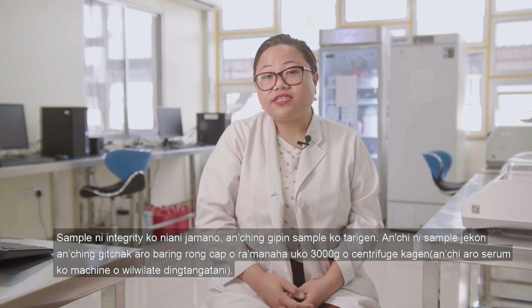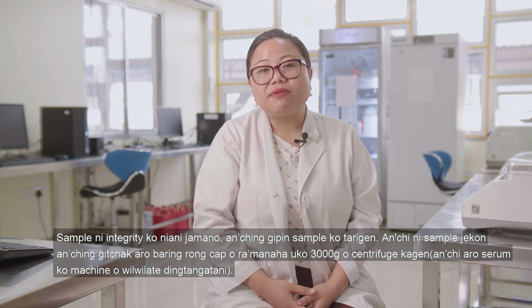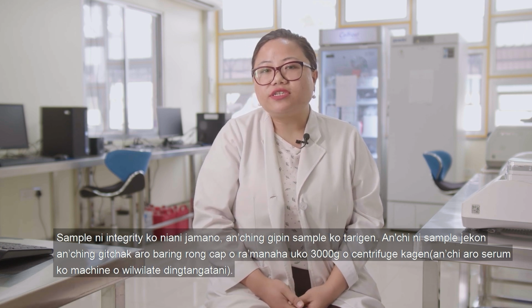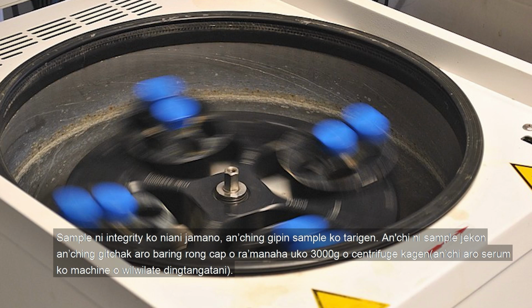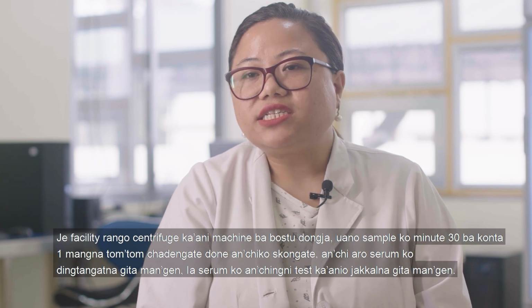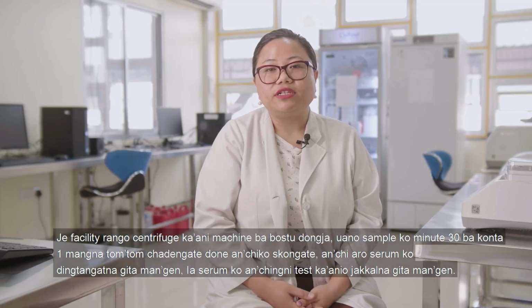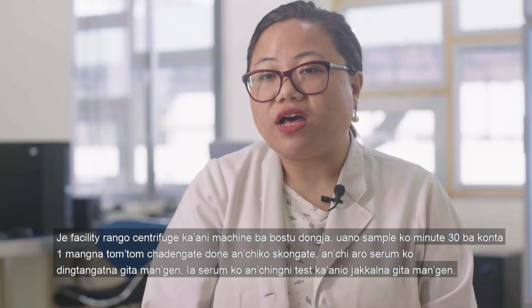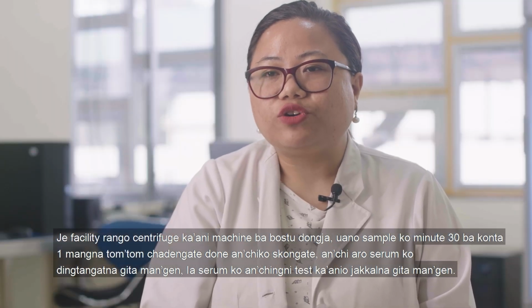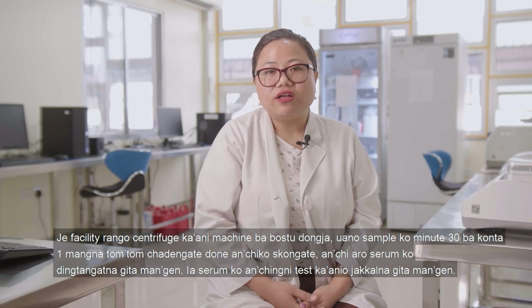After you have checked the integrity of the sample, you're going to prepare the sample next. For blood sample that's collected in red capped or purple capped vials, you're going to centrifuge the samples at 3000 G for either 10 to 15 minutes. To be noted that for red capped vials, in facilities that do not have a centrifuge equipment, you can allow the sample to stand for 30 minutes to 1 hour in order to allow for the blood to clot and the serum to separate. You can use this serum for your test.